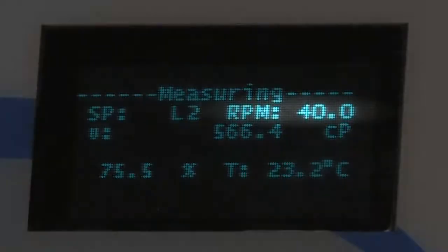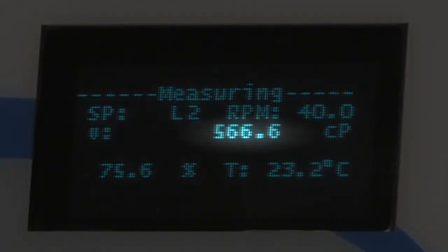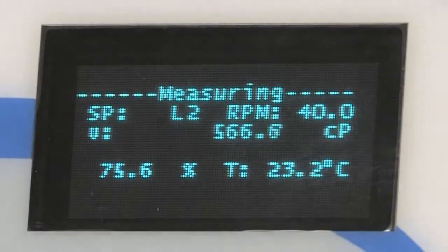Monitor selected speed, selected spindle, viscosity, and percent of full scale on the four-line or five-line vacuum fluorescent display.